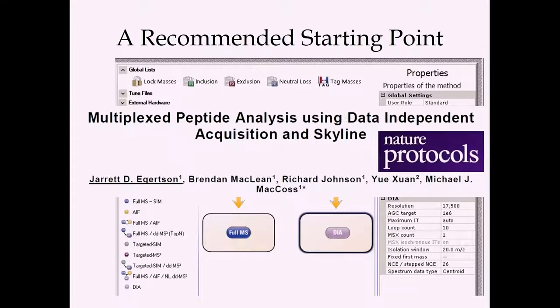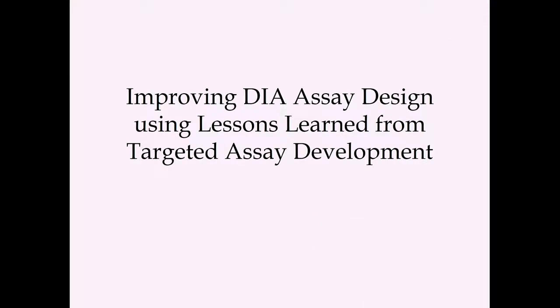Okay, in the last few minutes, I want to hit home in this area, and this brings us back a little bit to why I think of these things as a targeted assay and why I don't think about these things really as a big discovery experiment. The main thing is that once we started doing data independent acquisition, we just dropped all of the stuff that we had learned for doing targeted SRM for about 5 or 6 years prior.